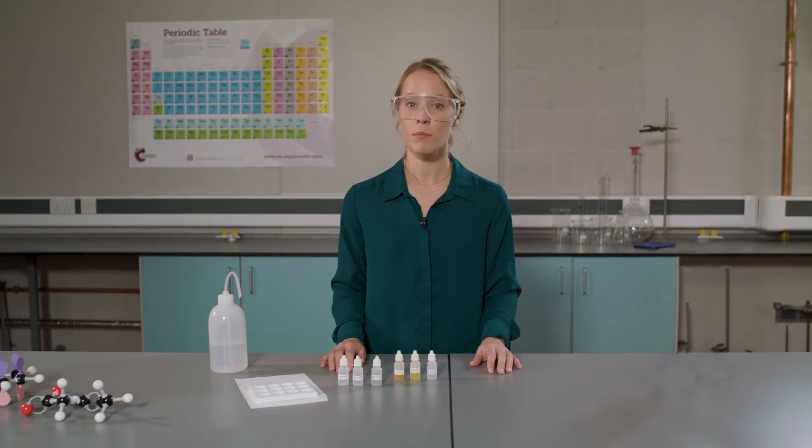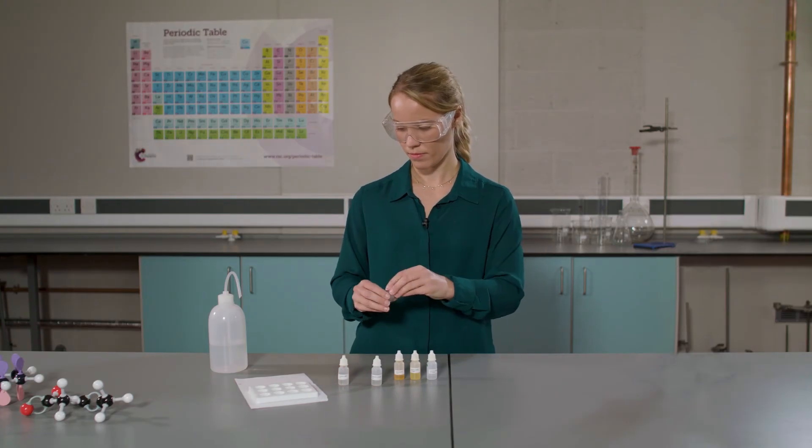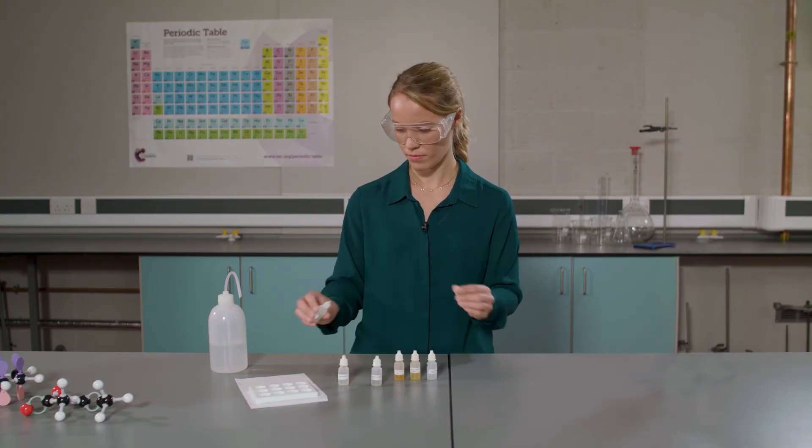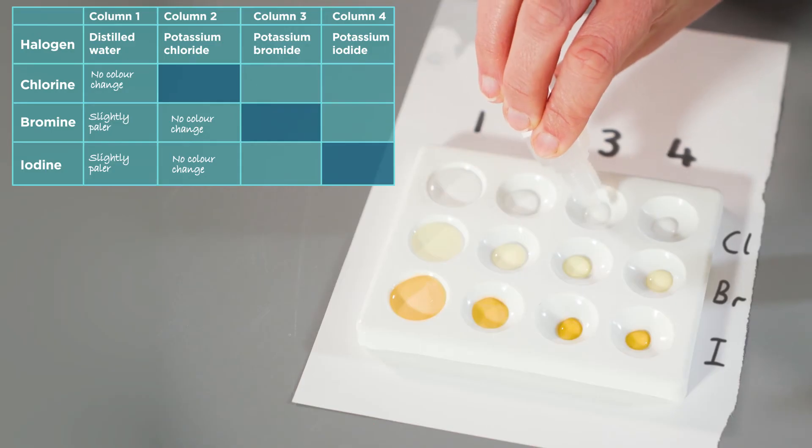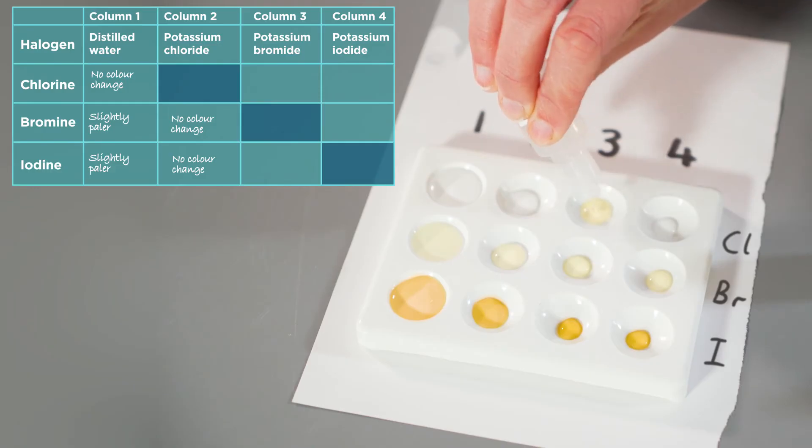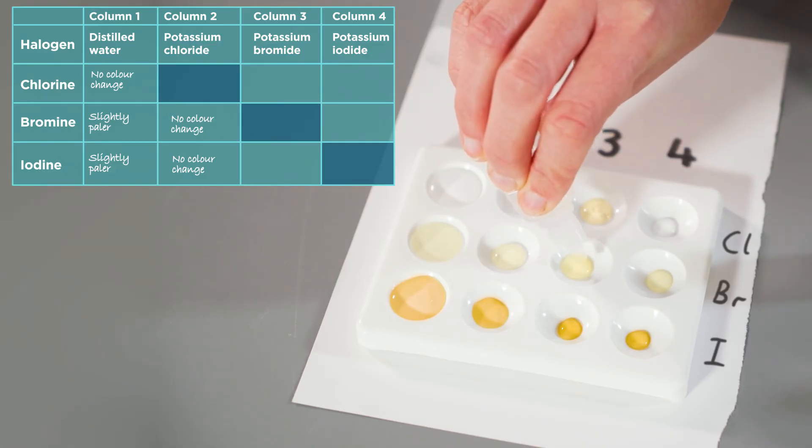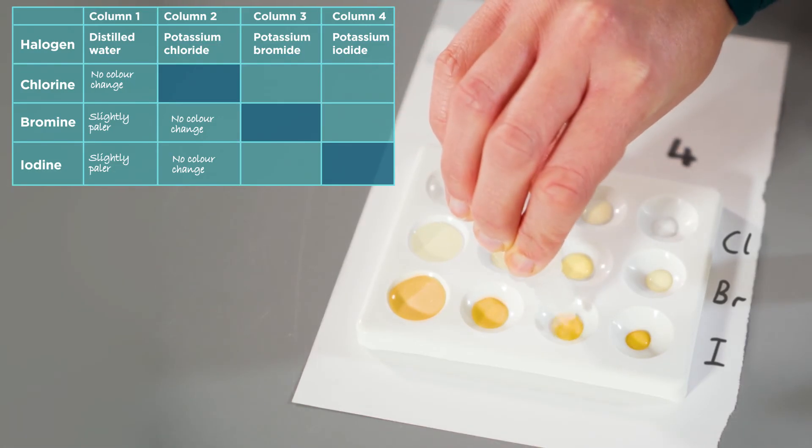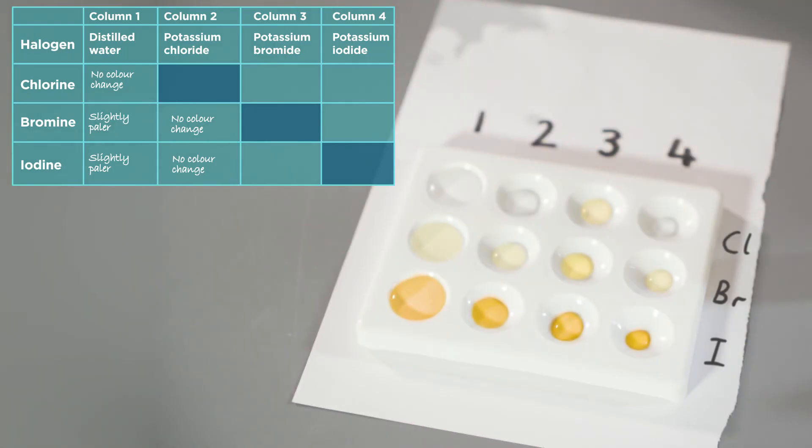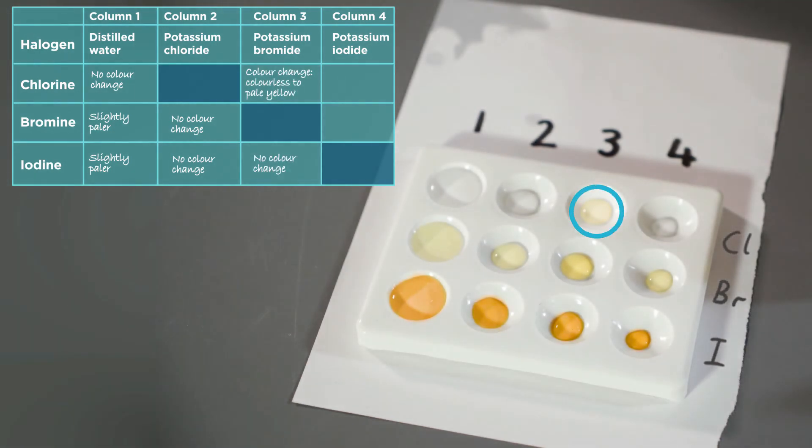I will now add potassium bromide to the third column. Carefully observe and note down any changes. Here we observe that when potassium bromide is added to chlorine water, a reaction has taken place.